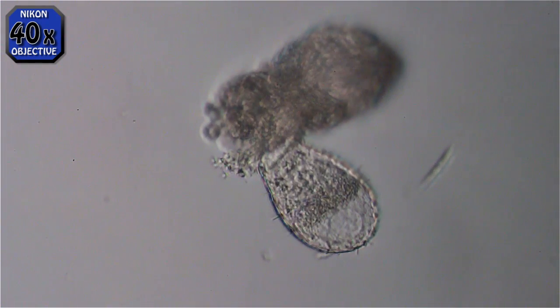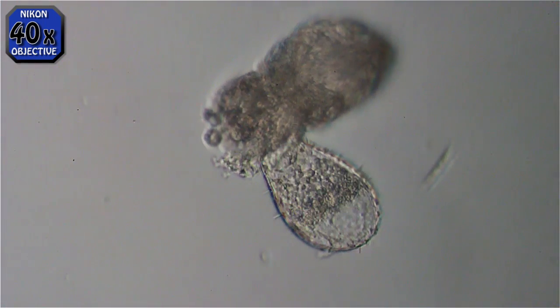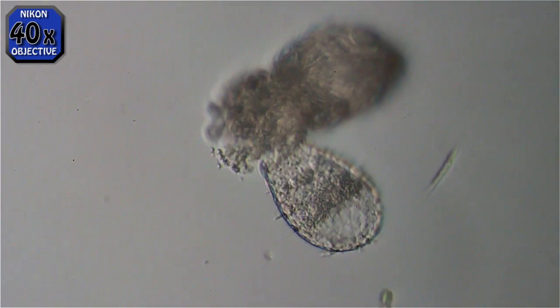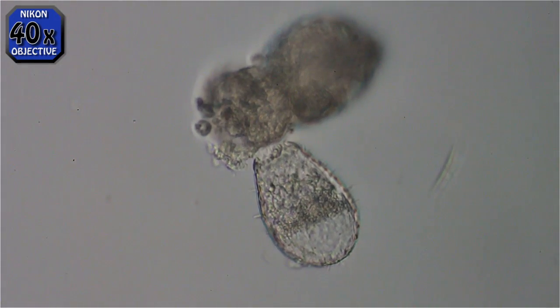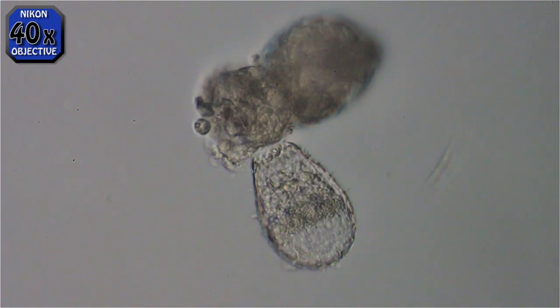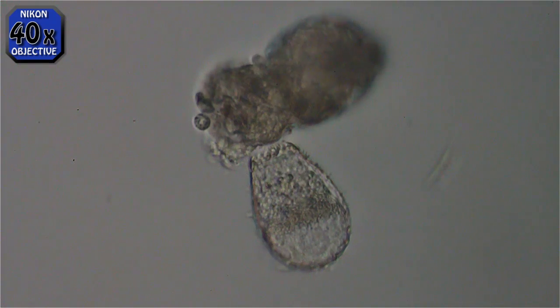Now I've sped up the frame rate again, very high. There you can see him — this is the only view of possibly his tentacles there, in between the sawtooth and his chicken leg.